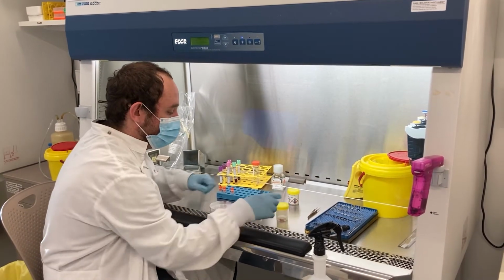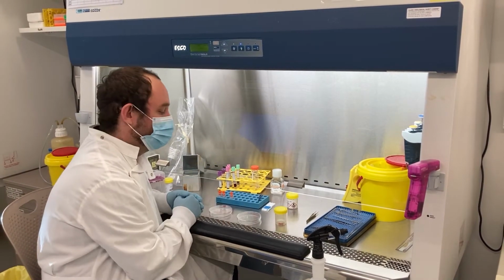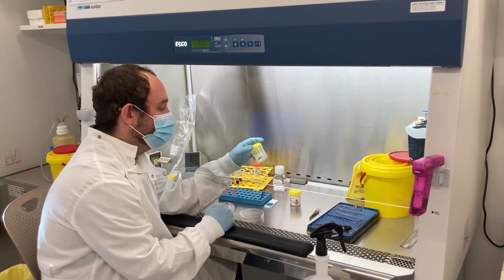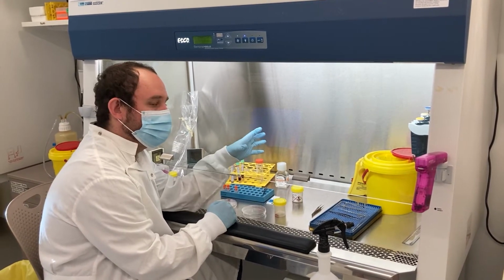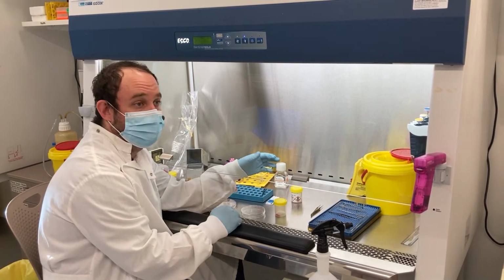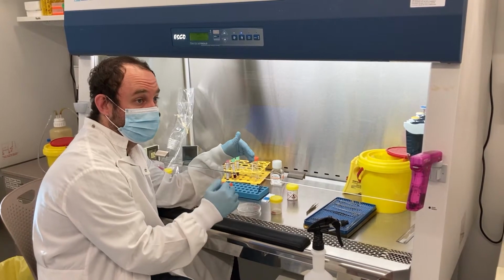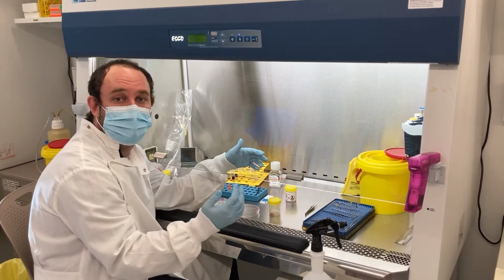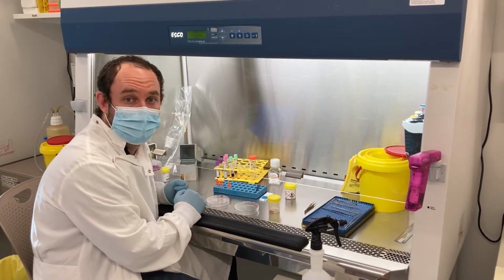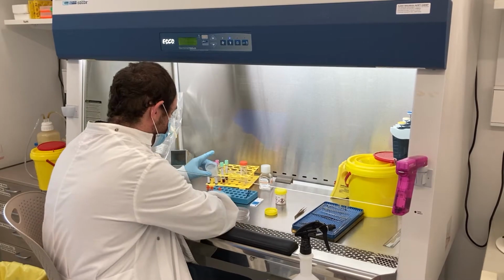Now, this patient's actually in the first stages of their cancer curative treatment. So they've received a staging biopsy, a TURBT, and this will be used to look at what kind of cancer the patient has, what stage it is, how aggressive it is. So our rationale here is, can we profile the patient's sample right now so that the clinician's armed with much more advice when the patient comes back to get curative treatment. So that's what I'll be doing right now. First things first.